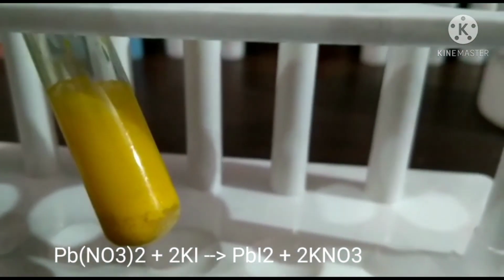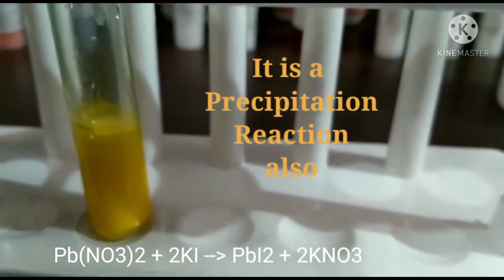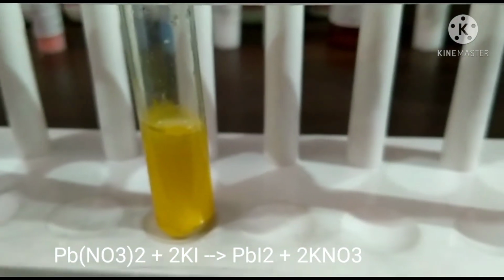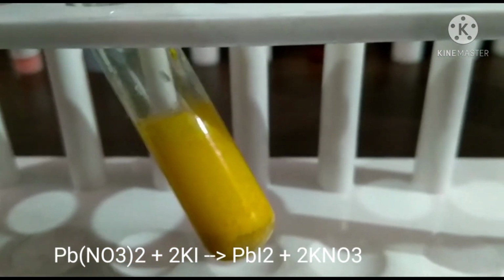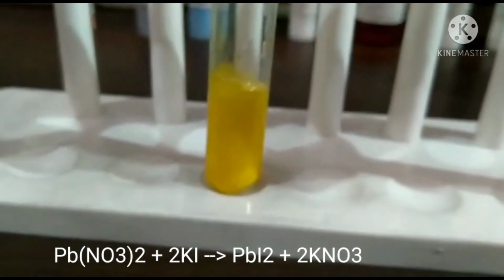Actually it is a double displacement reaction, but we have observed a yellow PPT here. So it is a precipitation reaction also. In a precipitation reaction we observe the formation of an insoluble precipitate. This is a double displacement as well as a precipitation reaction.